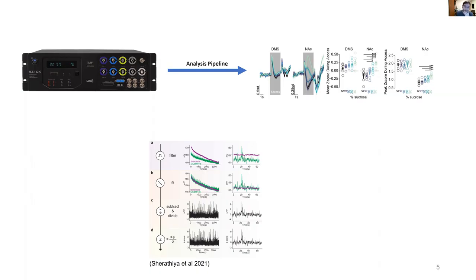But then people don't often think about how the actual process of applying these algorithms to your data can be done in a more efficient way. Many times people get trapped in this manual stage where instead of doing batch execution, they end up just running everything through GUIs or performing single file processing. But there's a better way, which is to automate this, where instead of using GUIs and single file processing, you just utilize functions and batch processing.